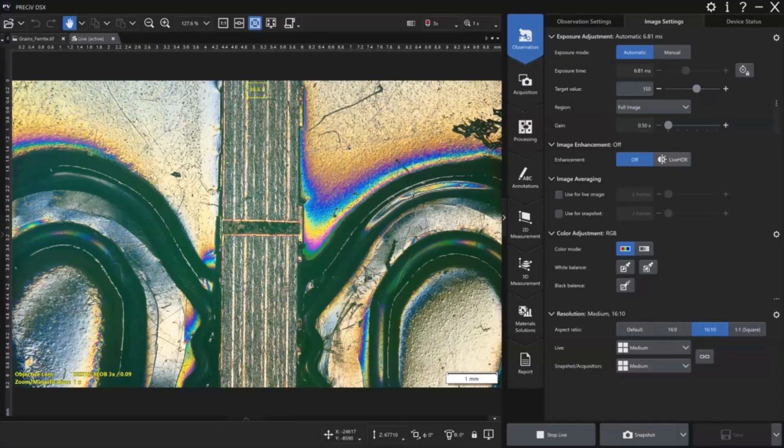And high dynamic range is where we can capture multiple images at different exposure times to balance out the contrast. You can also quickly switch your camera. Almost all of our camera modes are capable to do color or monochrome selections down here. You can change the aspect ratio of your camera if needed. So that's some of the basic observation settings and controls of the hardware.